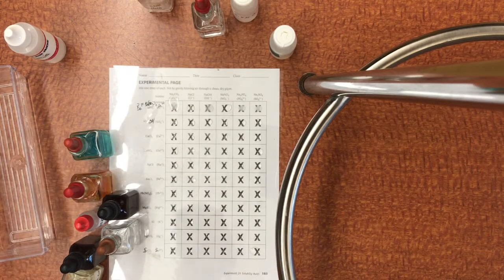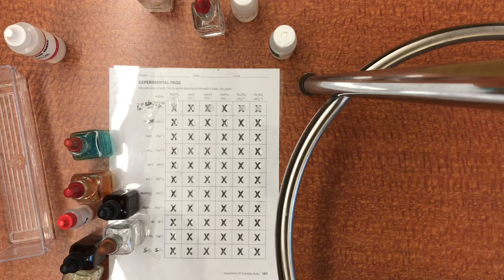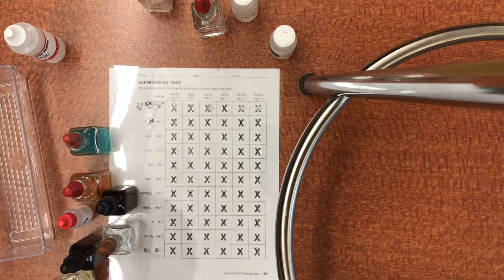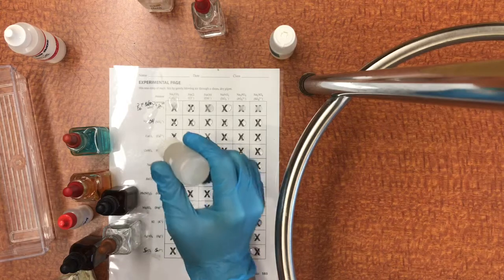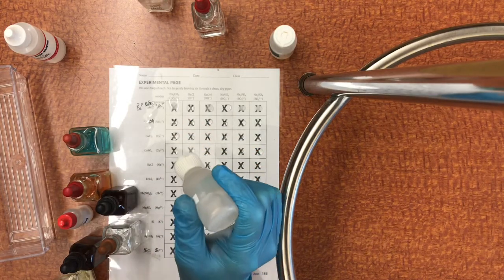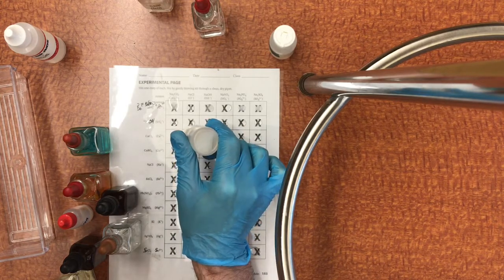All right, so let's go to the next one, which is calcium chloride. I'm just looking around for my calcium chloride here. I just had it. Magnesium, barium, strontium. Okay, oh, there it is. Okay, so here's my calcium chloride. So now we're mixing calcium with a carbonate. We should probably get a reaction there, but this calcium chloride might be too low concentration.